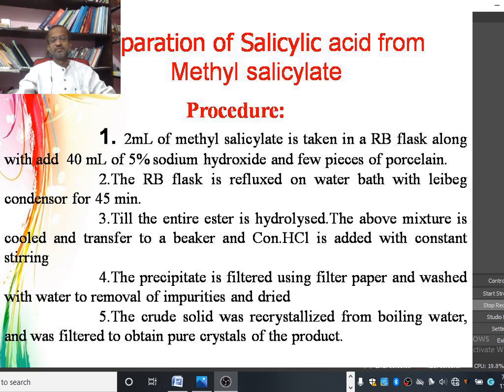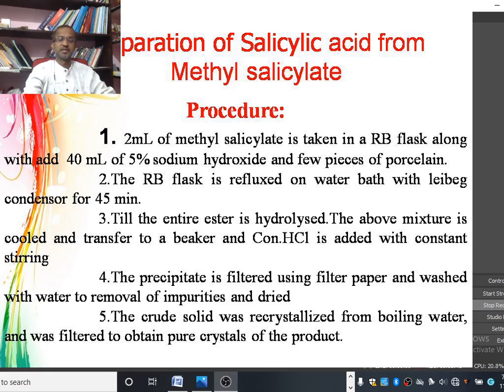The precipitate is filtered using filter paper and washed with water to remove impurities, then dried to obtain the crude crystals of salicylic acid. The crude crystals of salicylic acid are then recrystallized from boiling water and filtered to obtain the pure crystals of the product, salicylic acid.